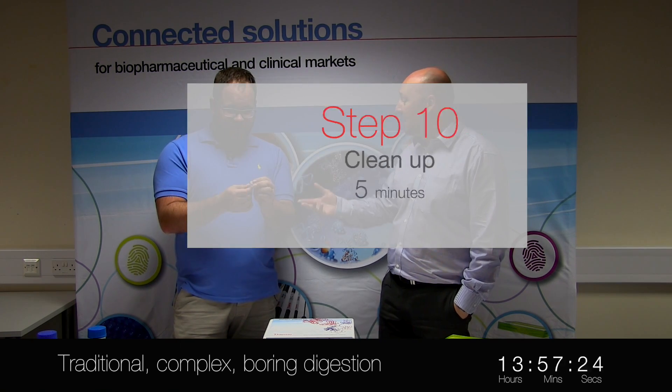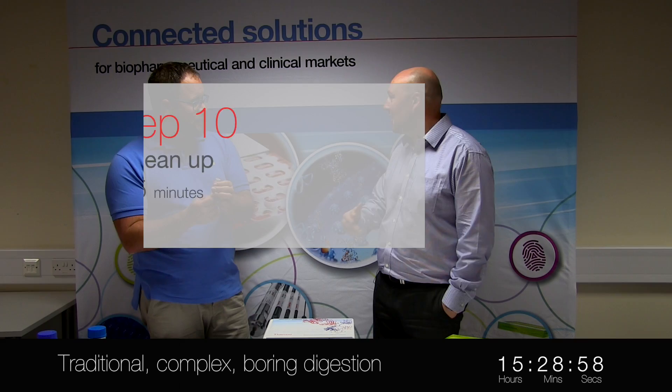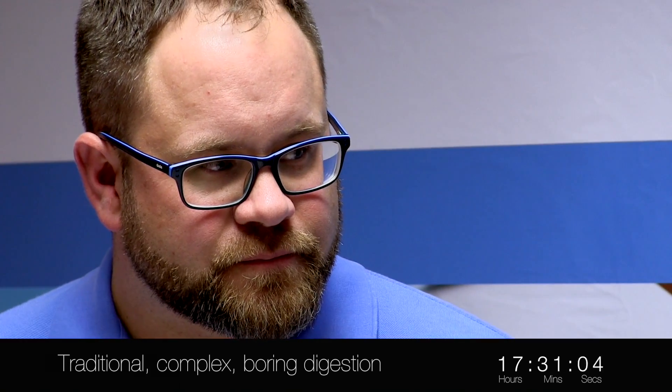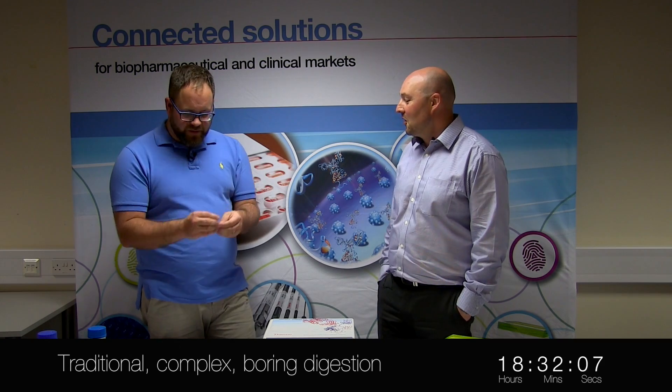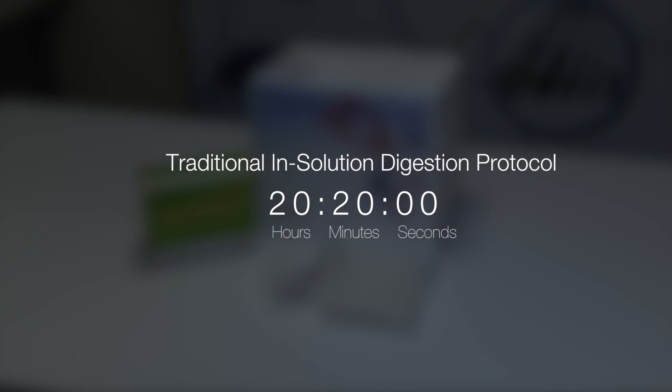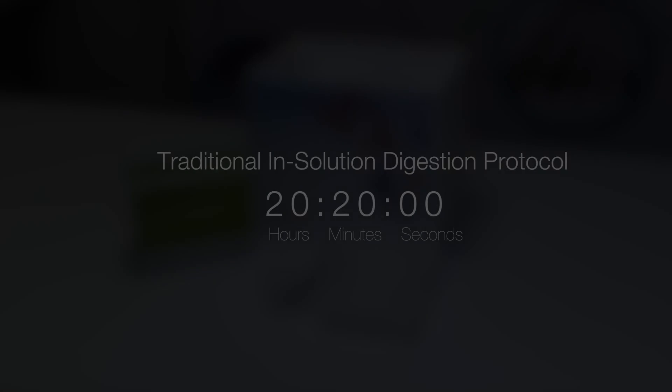So what you'd obviously need to do, depending on the complexity of your sample, you might want to do a clean-up step. That's how our customers are doing it now — loads of different steps, loads of potential for error. Would you like to see an easier way of doing this? That sounds awesome.